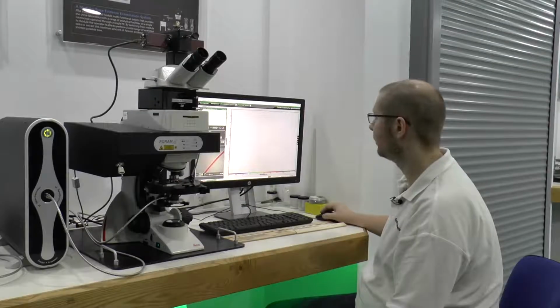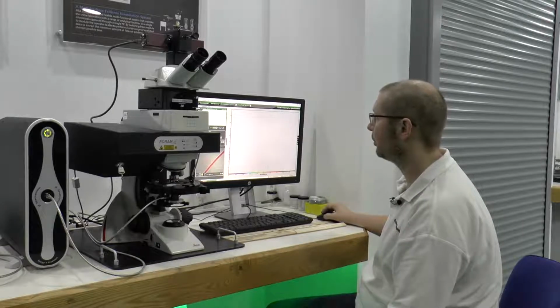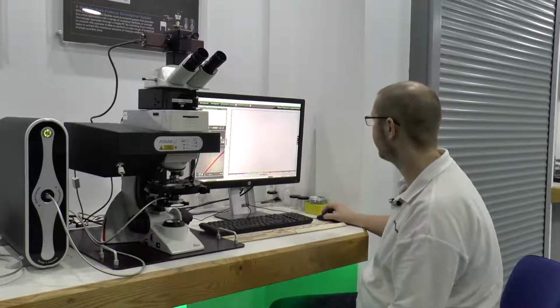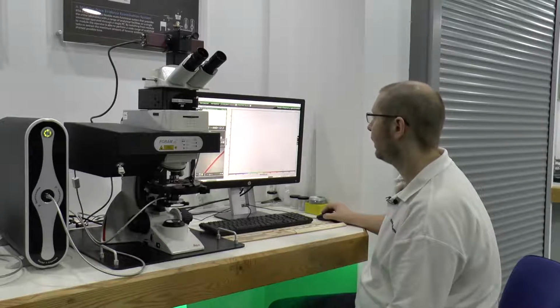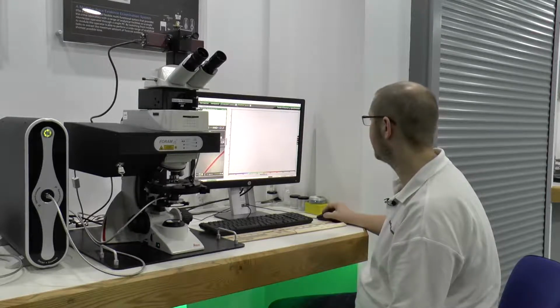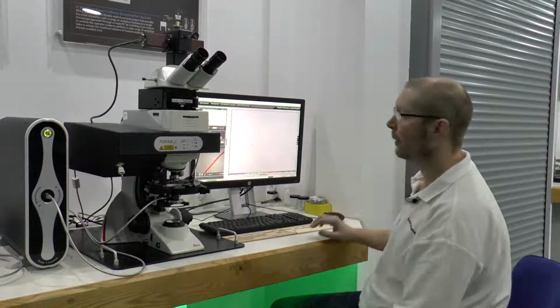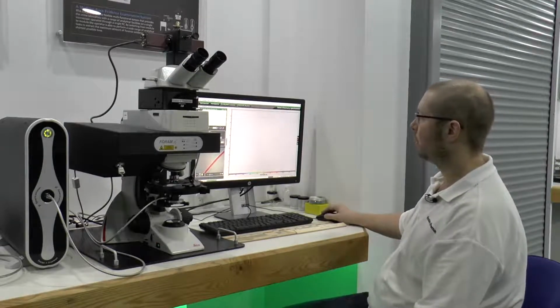And then the system will automatically determine the scan time based on the amount of light that is transmitting through the system, and it will record that 10 times, which I've set here as the number of repeat measurements it will take in order to create a spectral average. This just improves our signal to noise. Once it's done, we click OK. And now we need to record a dark reference.